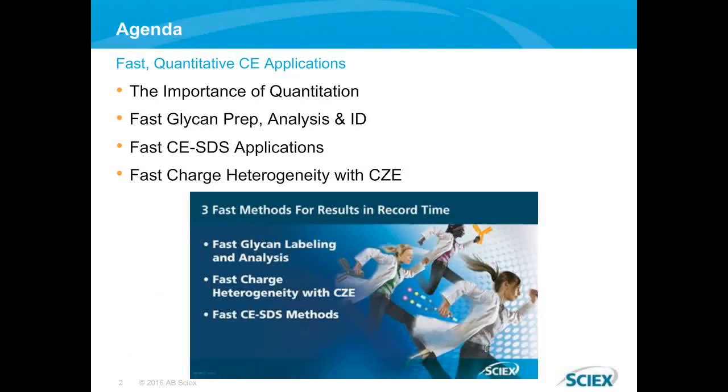So just a quick look at the agenda for this morning. As I mentioned, we've got 3 assays that we want to go through, but first I want to spend just a little bit of time discussing the framework for all of this, which is the importance of quantitation. So I'll spend just a couple of minutes walking through this section on quantitation when performing characterization assays on any of your molecules, and why it's important to remember that just because we're going faster doesn't mean we're going to try to lose any of that quantitative data.